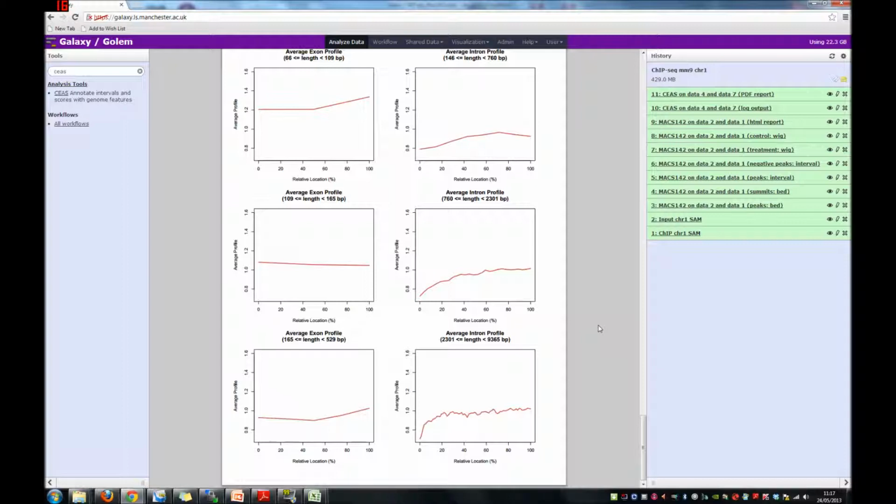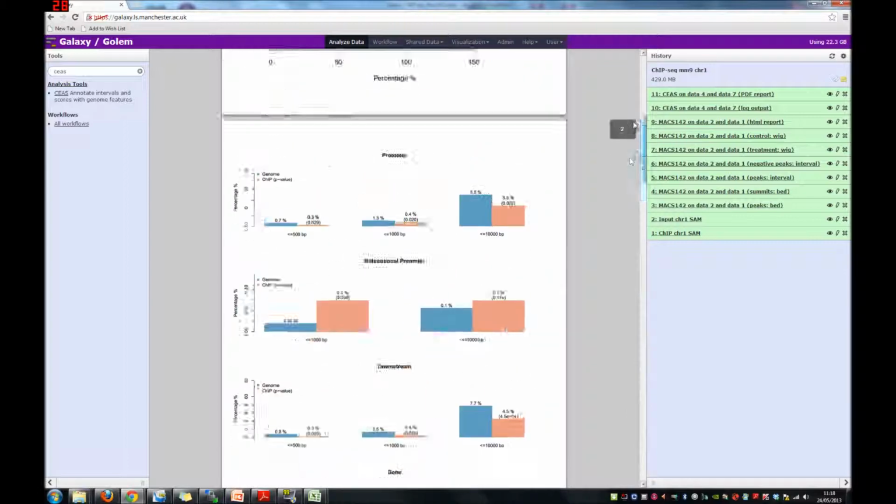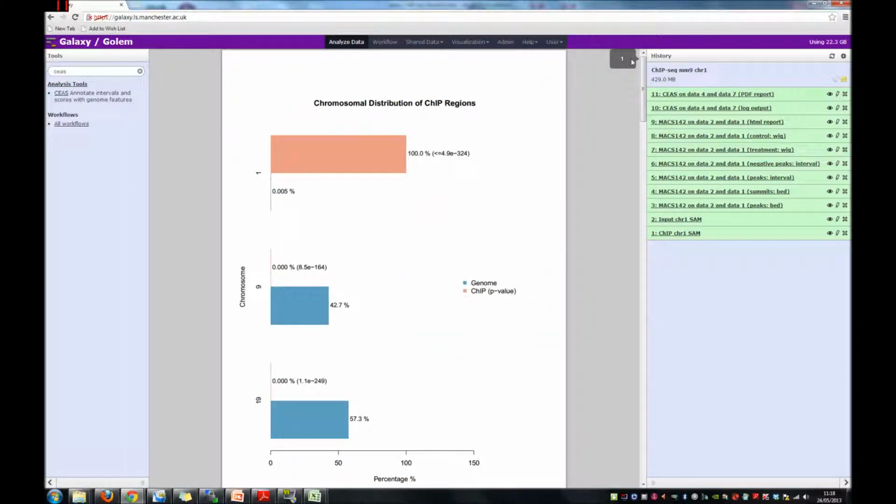What you're better off doing is finding the description of CEAS, which is much more concise and well put than me talking in this video. Again, if you go to the shared data area, published pages, you'll see the basic ChIP-seq page that I've put there. Okay, so that's CEAS.